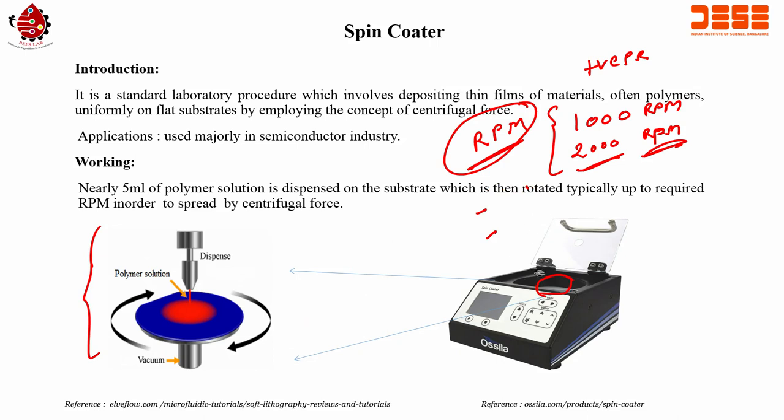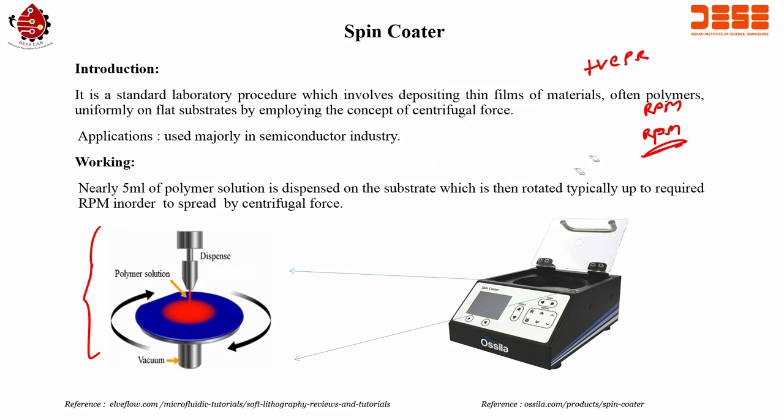I will show you the actual procedure of how the spin coater is used in the laboratory. So, I will go to the next slide now.